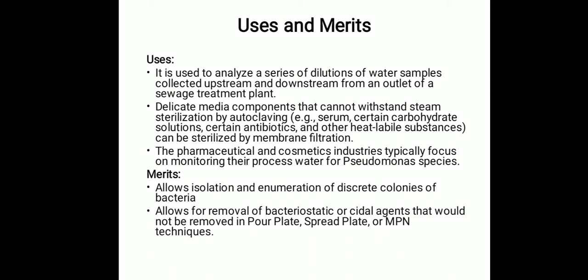Now coming to the merits of the MF technique. Results are available in a shorter period of time, and larger volumes of samples can be processed. Because of the high accuracy of this method, the results are readily reproducible, and it allows isolation and enumeration of discrete colonies of bacteria.